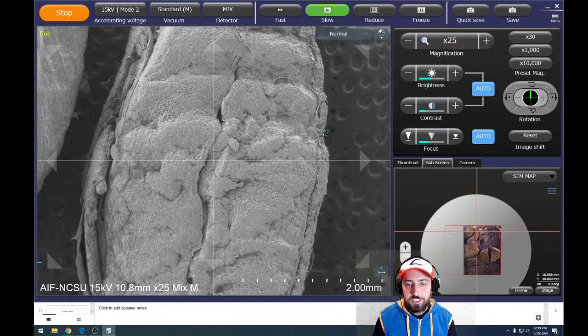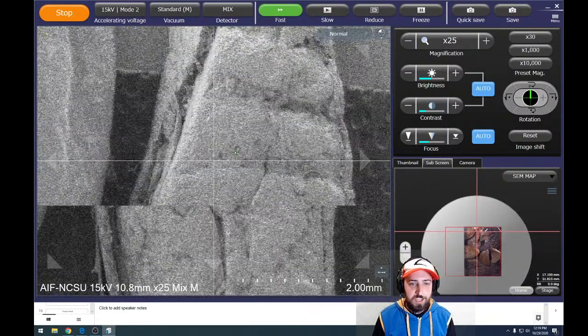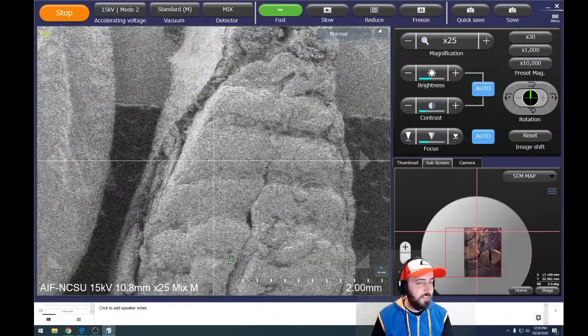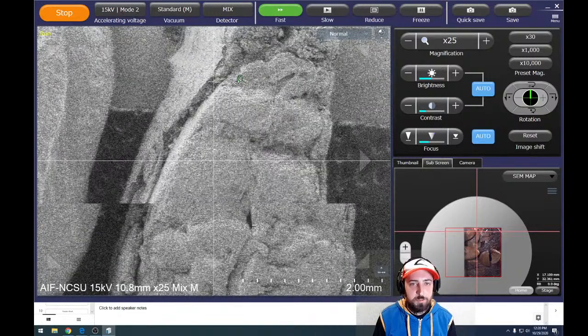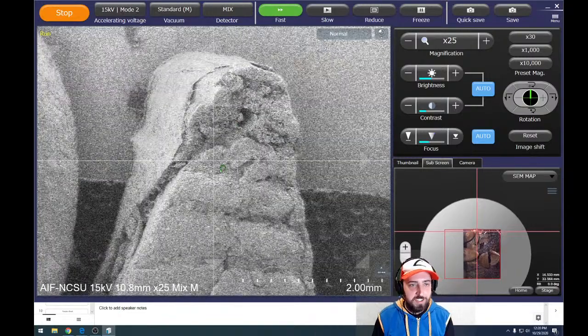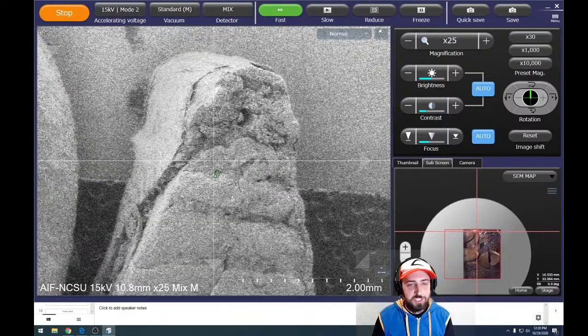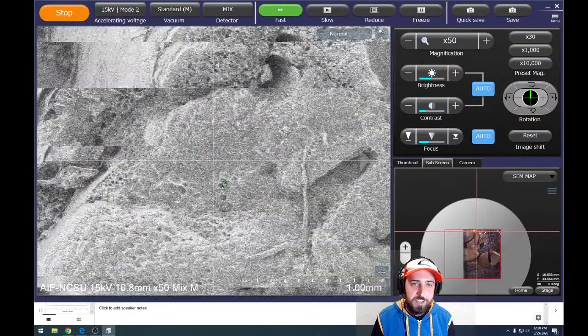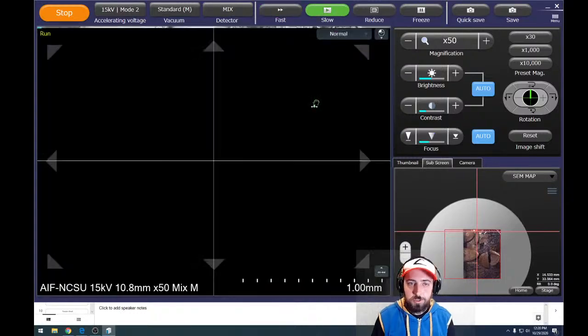And we can still see the outer coat, which is meant to protect it. So that's what the outer side is. I've always noticed that the inside of a seed always has this gap in it. I'm not sure exactly what that is, but let's go up to the top here. Again, I think this is the part of the seed that we were just looking at, the end where it's very narrow. Let's try and do a slow scan here.